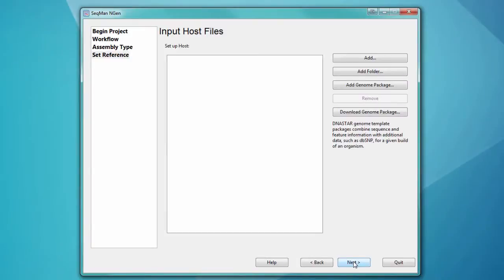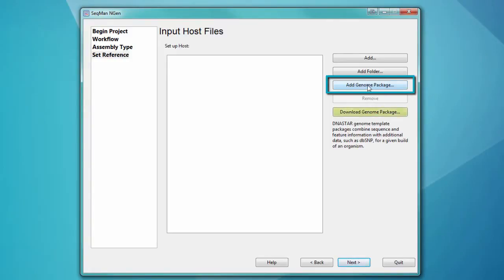In this example, I'm going to assemble data from a human gut metagenomic sample. I first want to load the human genome template package, which I've downloaded from the DNASTAR website.